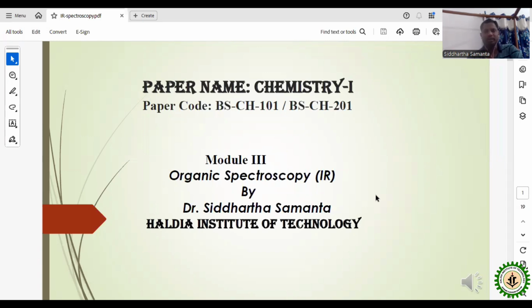Today, I will discuss a very important topic of organic chemistry: infrared spectroscopy. In the previous lecture, I already discussed UV-visible spectroscopy. From UV-visible spectroscopy, we understand what type of unsaturation is present, that is, whether a molecule is unsaturated or not. This type of phenomenon we understand from UV-visible spectroscopy.